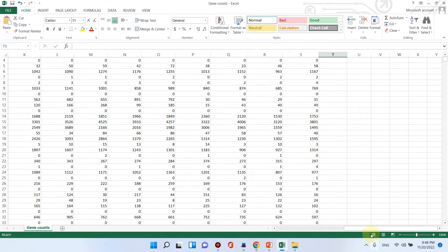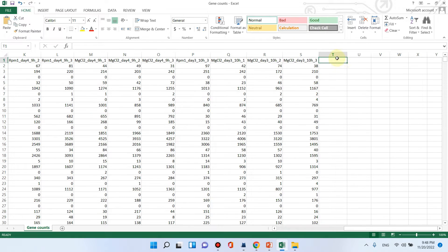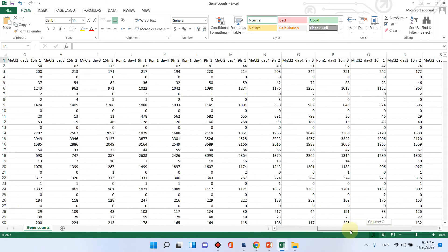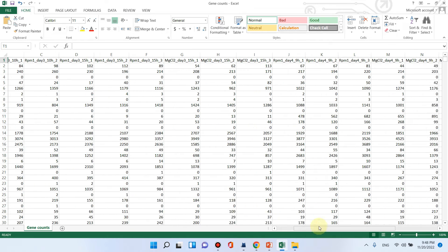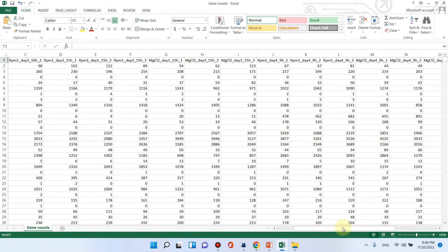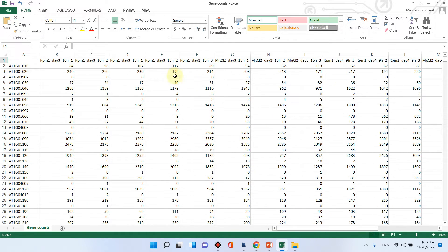You also don't need to give any log FC value or p value in this column. You can also use FPKM values rather than gene count values if you don't have the gene read counts data.